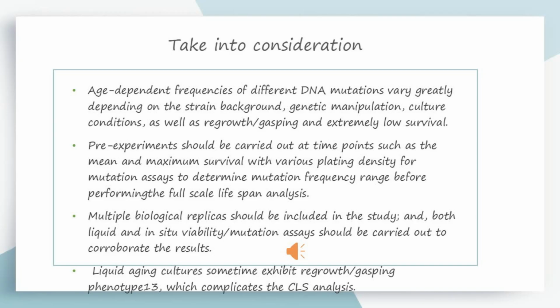Multiple biological replicas should be included in the study, and both liquid and in situ viability/mutation assays should be carried out to corroborate the results. Liquid aging cultures sometimes exhibit regrowth/gasping phenotype, which complicates the CLS analysis.